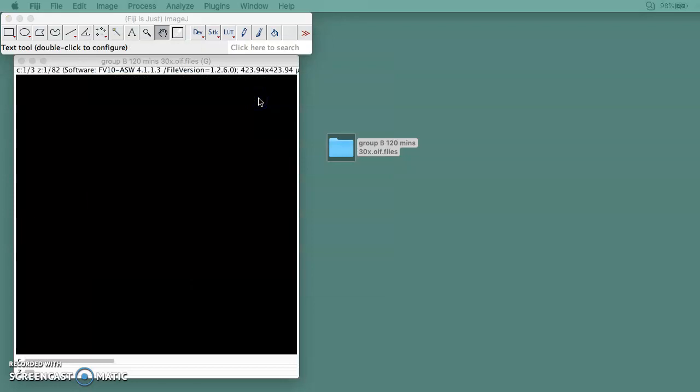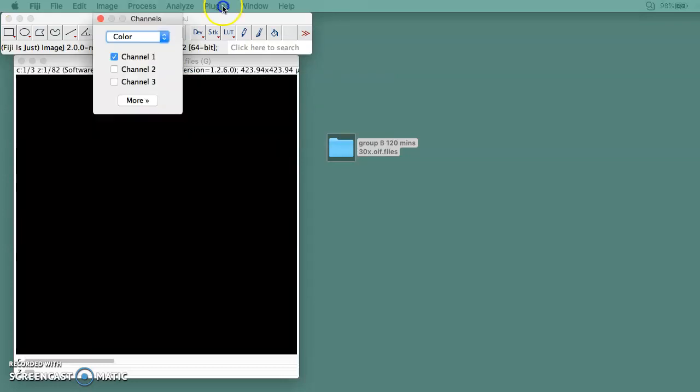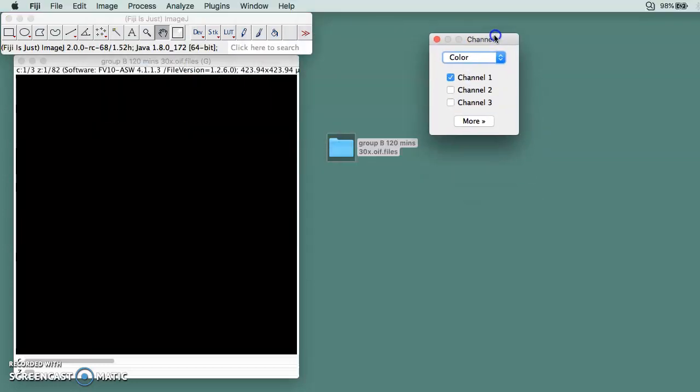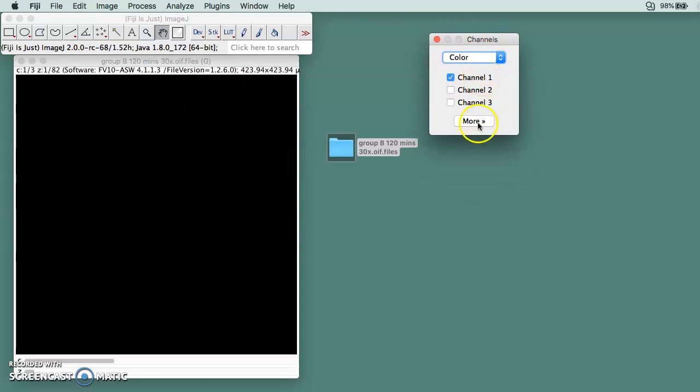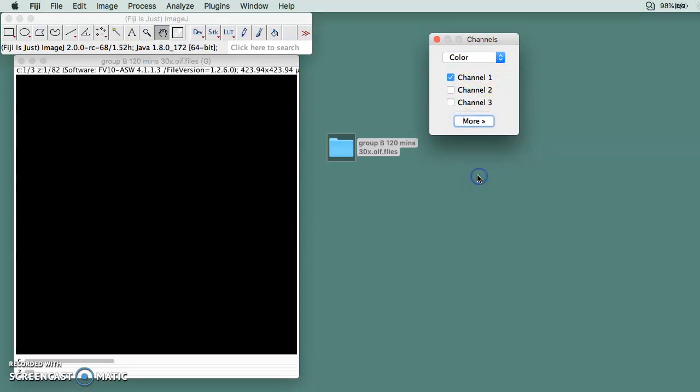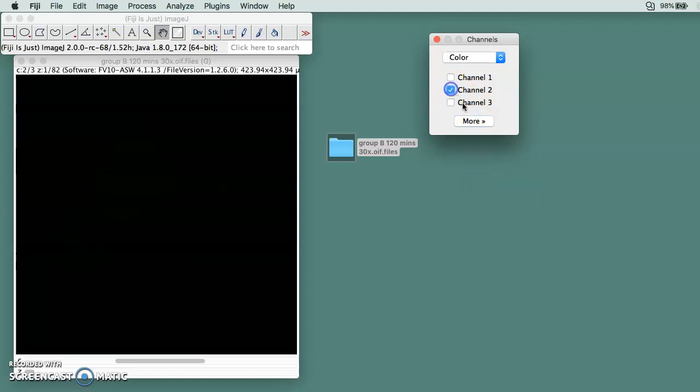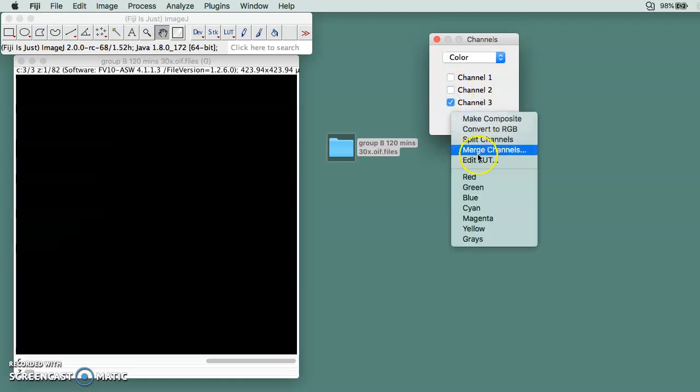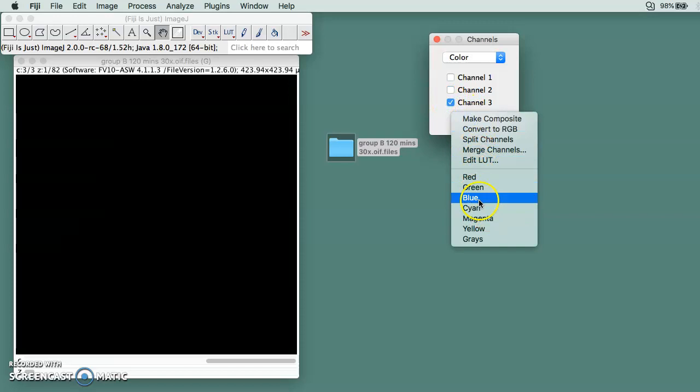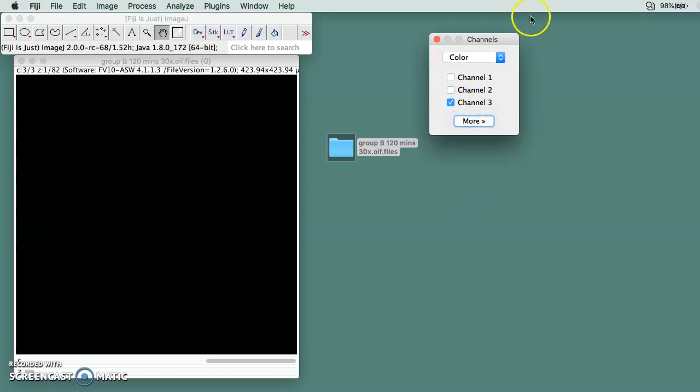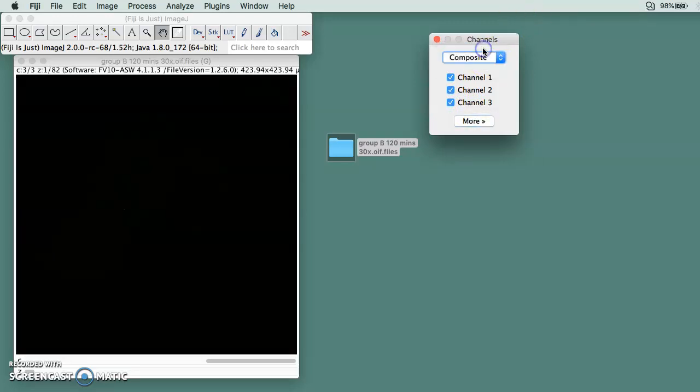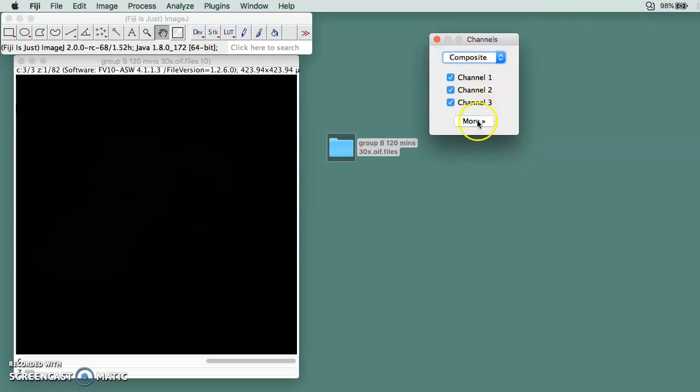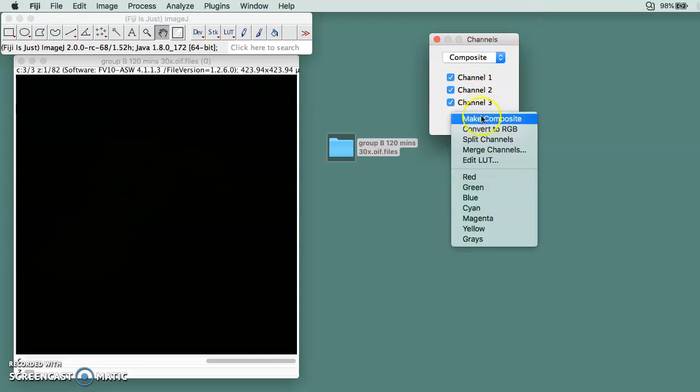Once it's open, you go to Color. Channel 1 should be red, channel 2 should be green, and channel 3 should be blue.